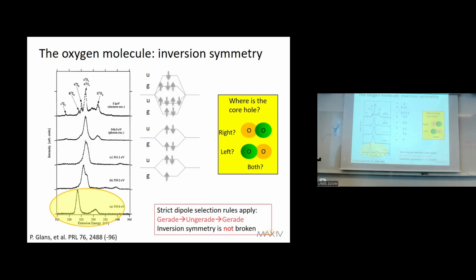So this is what happens there, and then I should see only the ungerade. So if I go to that excitation, I see that the spectrum has changed. We lost this one, and as you see, the elastic peak has moved. Of course, it's not completely pure because you're never completely pure in the energy of this.